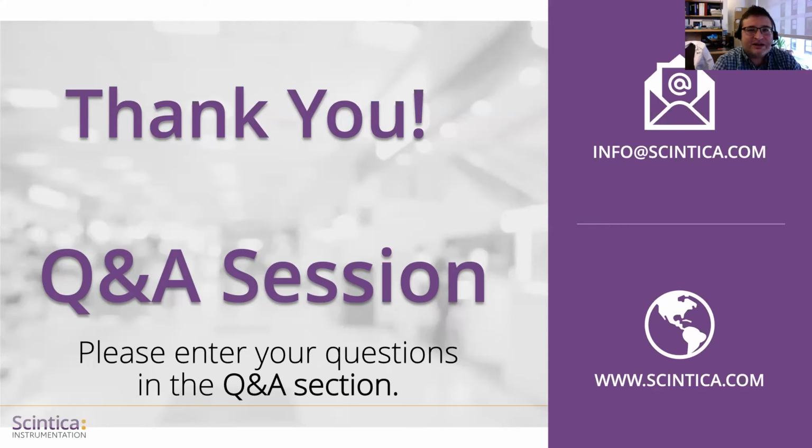So I would say when you get results about bone mineral density, I wouldn't go and run with it. I would always tend to want to confirm it with microCT afterwards. I hope that's not too vague an answer to a really good question, but yeah.